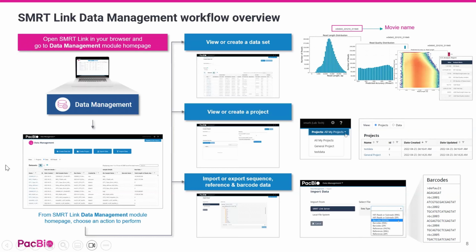Data management also allows for informatically filtering datasets by read length and/or quality scores using the Create Dataset option. If datasets need to be sequestered for specific use cases, the Create Project option can be used. This provides the ability to sequester specific datasets for access and analysis by users assigned to that project.